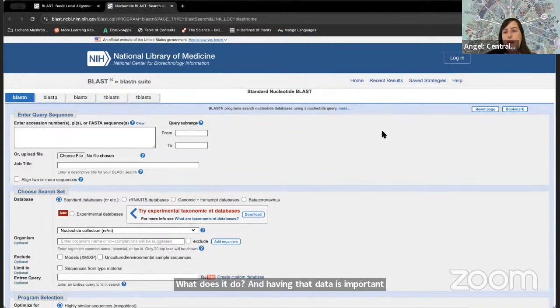Yes. And I know with Mycota, at all of the events when they do DNA barcoding or when you do the Myco Blitz, they require an iNaturalist unique ID associated with each specimen. That's kind of what they use. So if you don't already use iNaturalist, get on board. It's super fun.